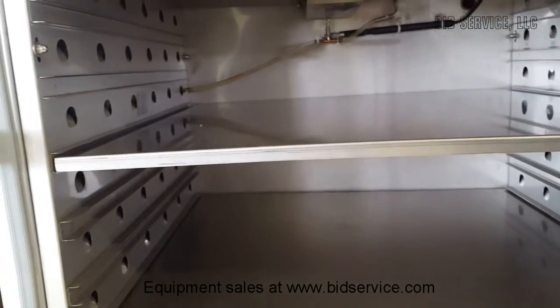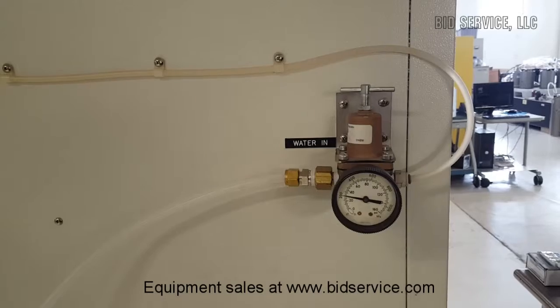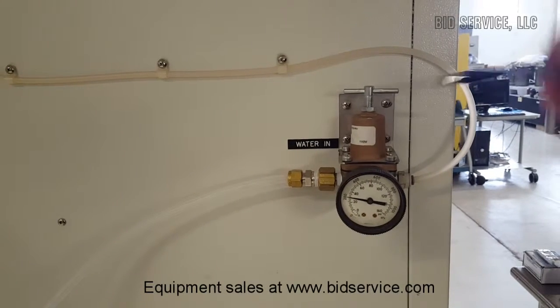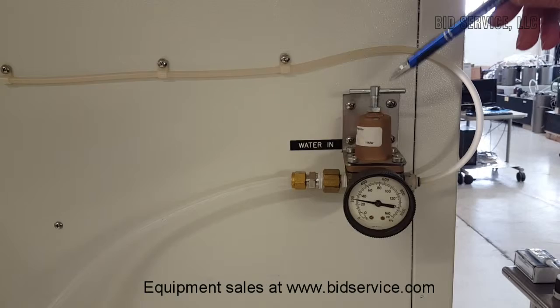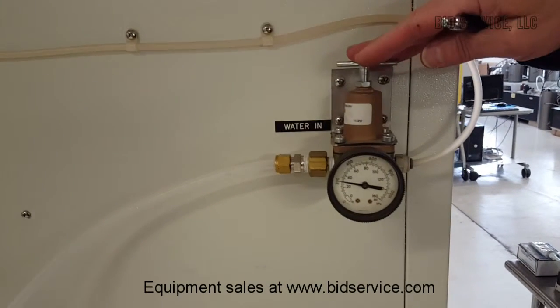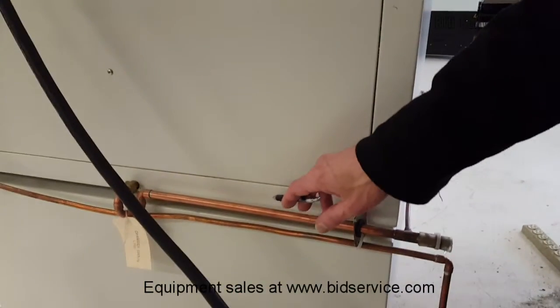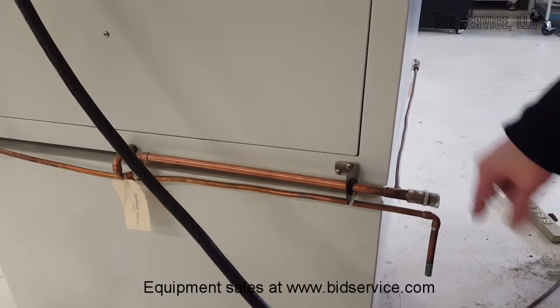You can see all the drain lines. So once the humidity goes up, it'll get very wet inside here and of course it'll drain out from the front door through this hose, and then back here through there and hose it back. Here's your water in supply — it's regulated. You can regulate it down to around 20 PSI, which should be fine. Here are the drains coming from the front door and from the chamber inside, just opened up to a drain.